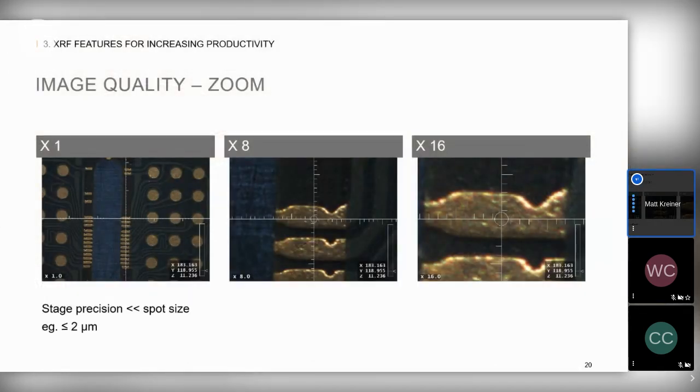The features being measured are very small and are difficult to see with the naked eye. XRF instruments have a high definition camera that provides a clear image of the part and its features. From the camera view it is possible to magnify the image up to 16 times so the user can position their parts precisely where they need to be. There are software controls for the camera and for zooming, and in some cases you can also zoom by using the mouse scroll wheel, which I find to be more convenient.